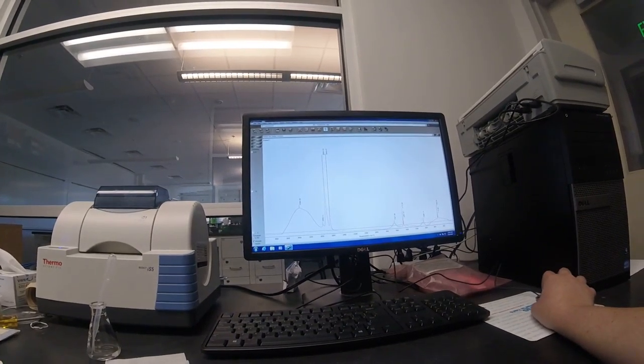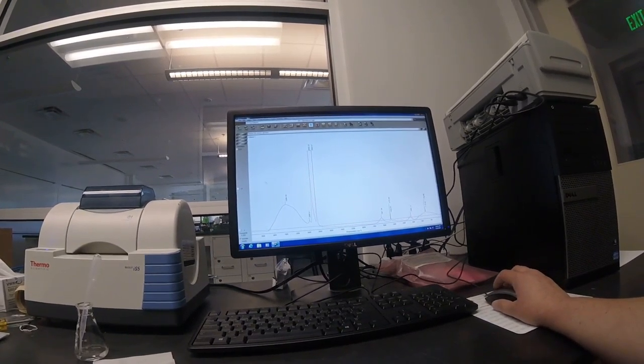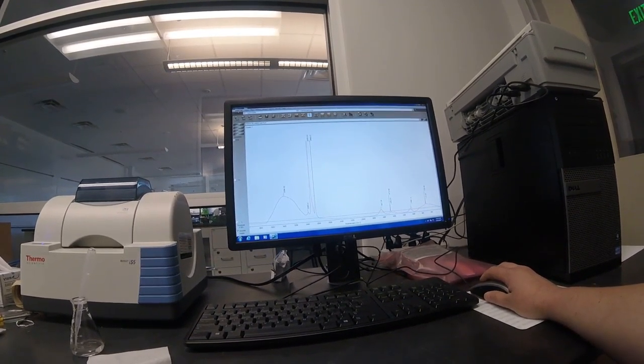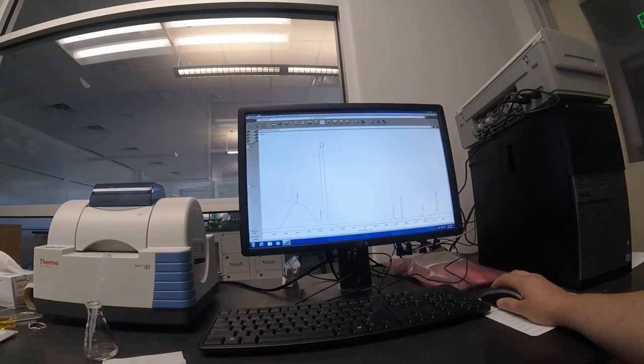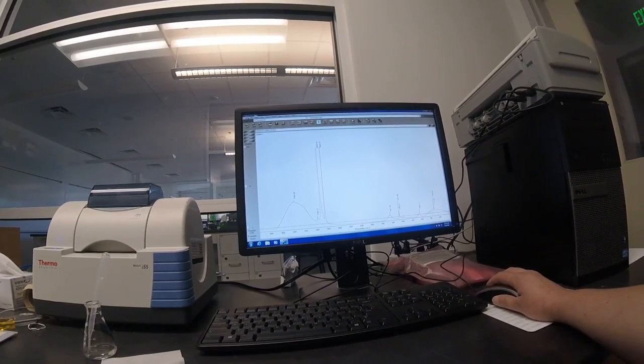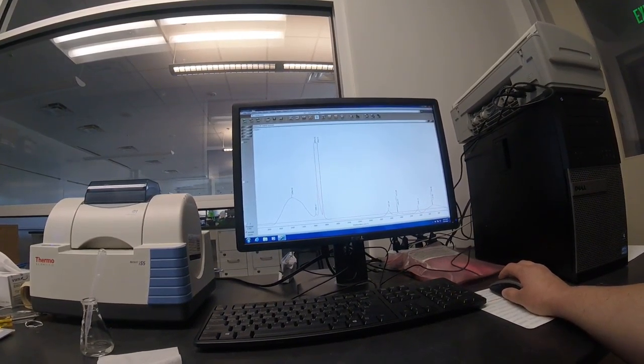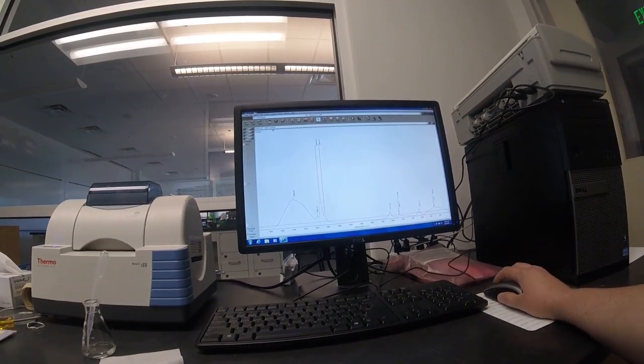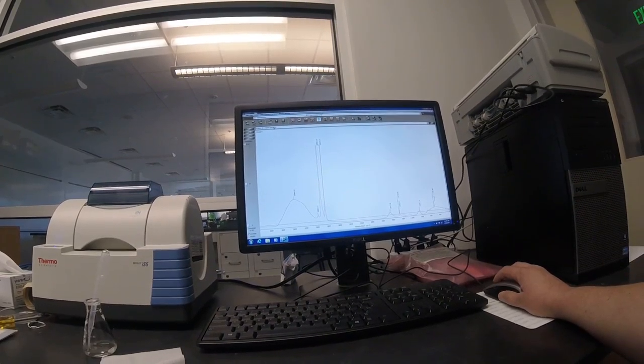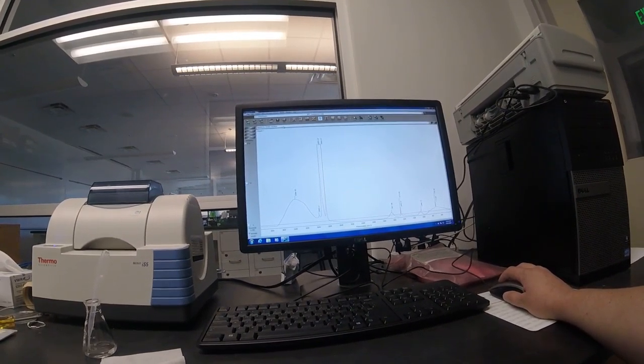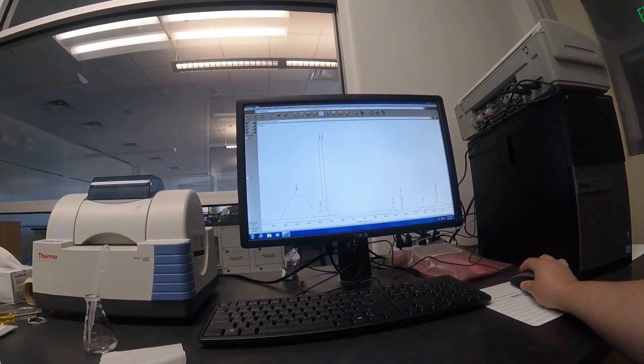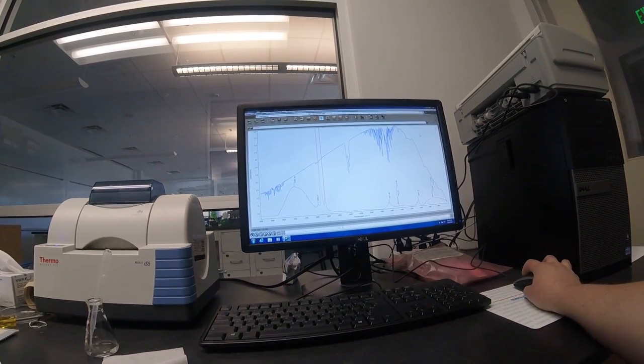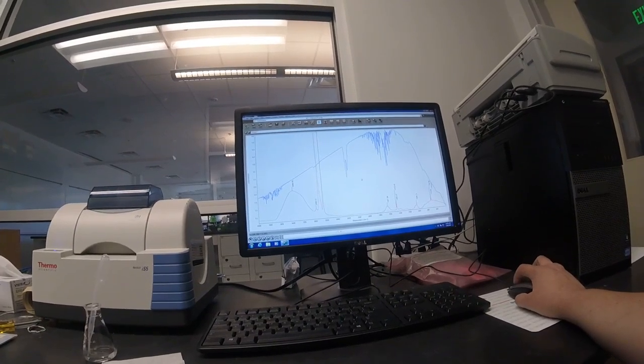That's awesome. Look at all those peaks that I just found. And then we're going to add that to our spectrum. We can either replace the original spectrum, or we can add it to the spectrum. I think I'm going to actually replace it. I like the replacing of the spectrum.